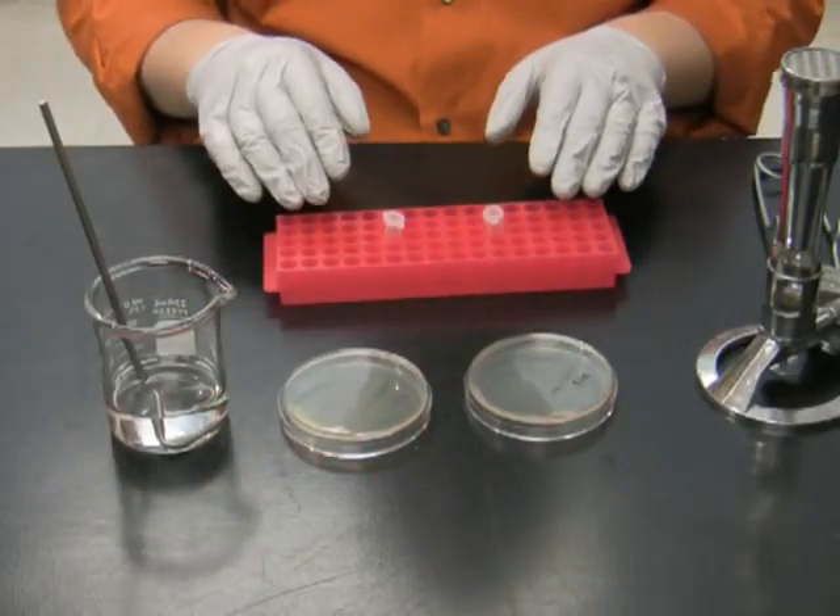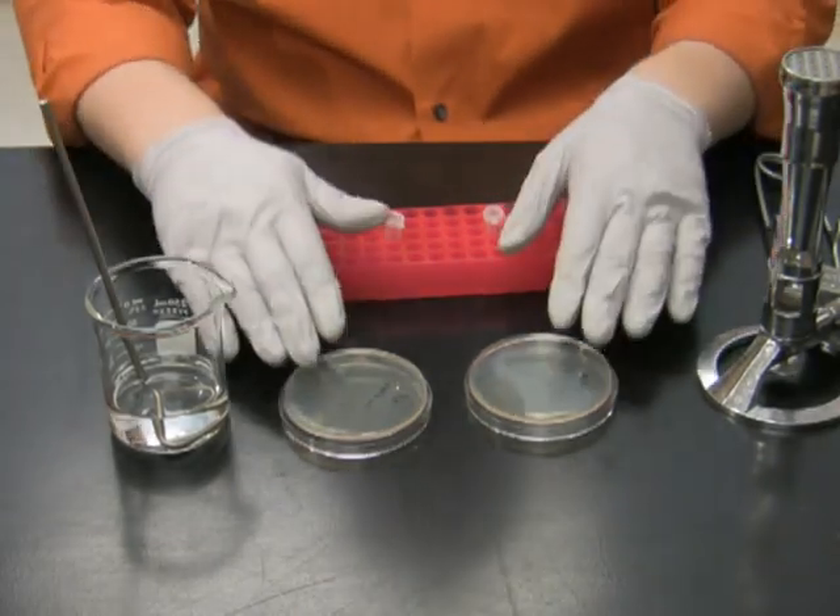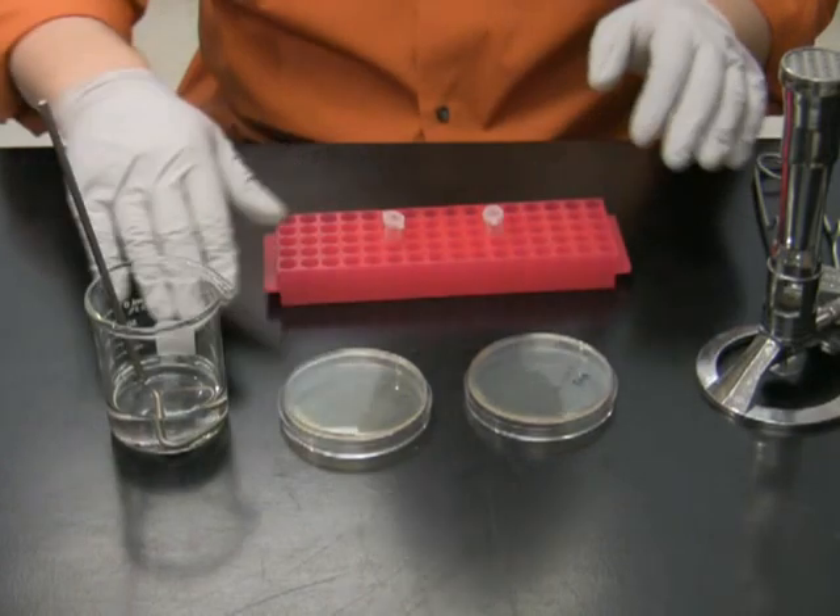Now we are ready to plate the cells. For plating we will need a gas burner, 2 LB plates, a beaker with ethanol, and a spreader.